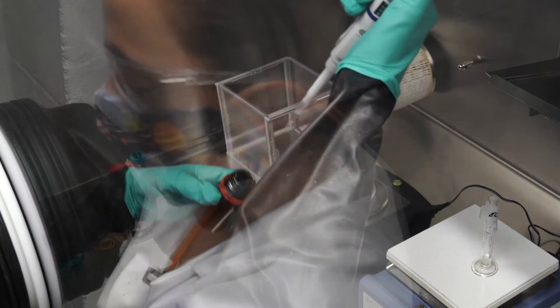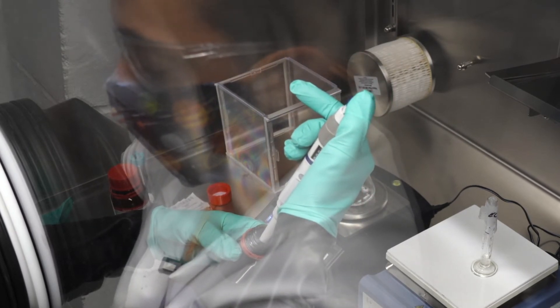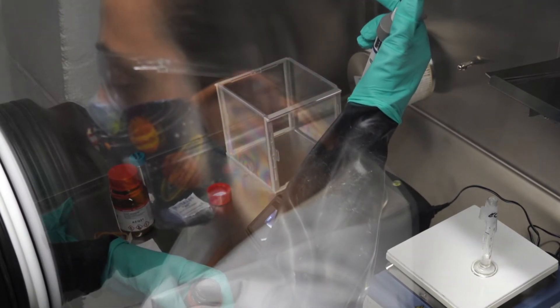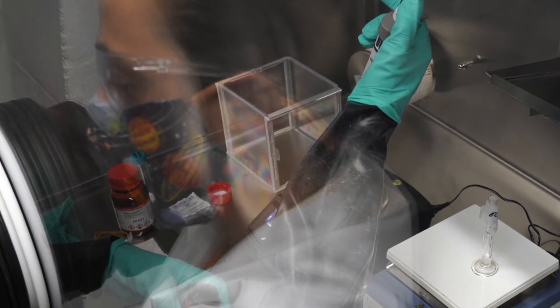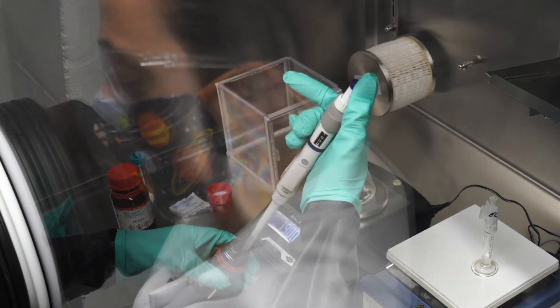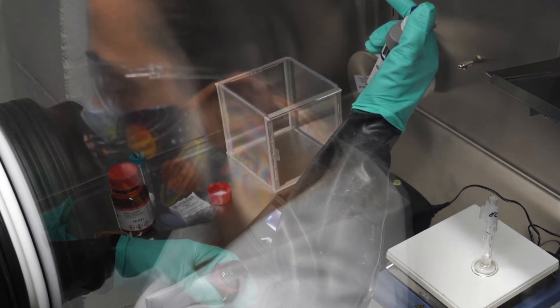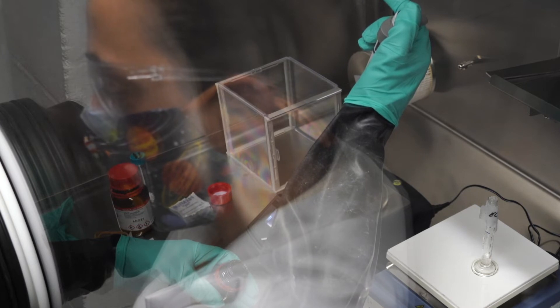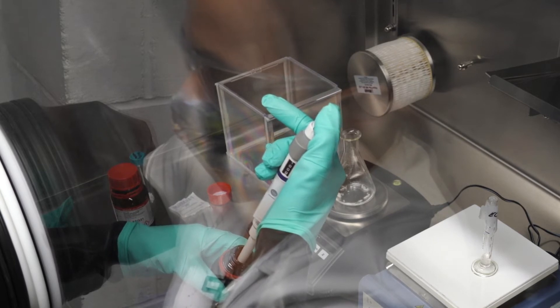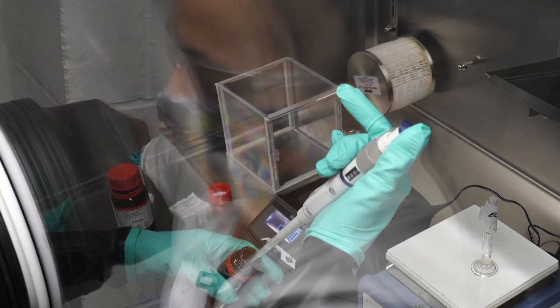Not much came out. 4 grams will be considerably less than 4 milliliters. I'm going to pour it in because it goes back to solid once it reaches room temperature.